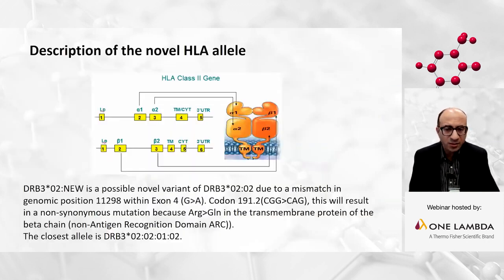So this means that we actually have a novel allele. So we confirm it. We did our extra homework. We look at the read coverage. So let's see now how can we describe this novel allele.